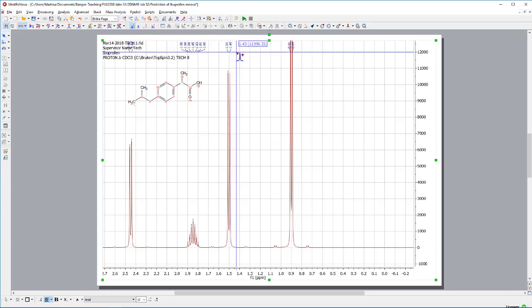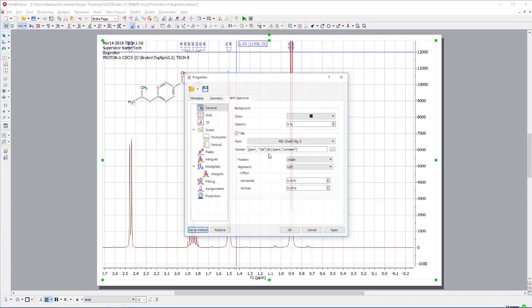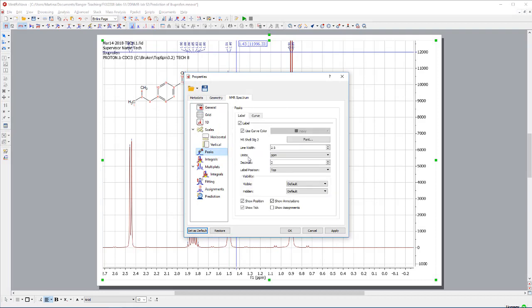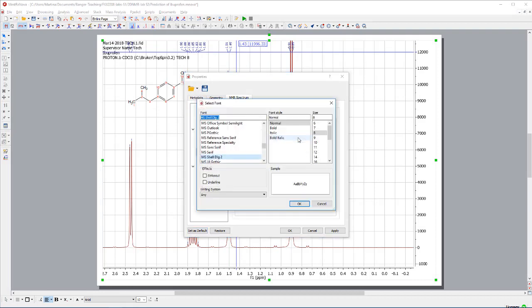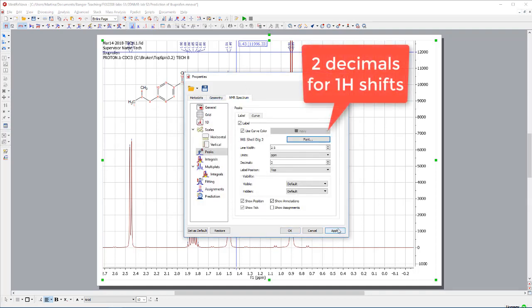If I find that I can't read my numbers here, I can always go and change my font size. I may want to have it in 10, so it's a bit easier to see. Two decimals is fine. Yeah, that just looks good.